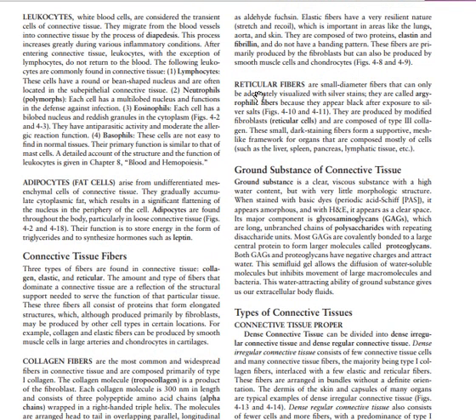Reticular fibers. Reticular fibers are usually argyrophilic fibers, meaning that they absorb silver. So they are going to be dark in color when you use a silver stain.